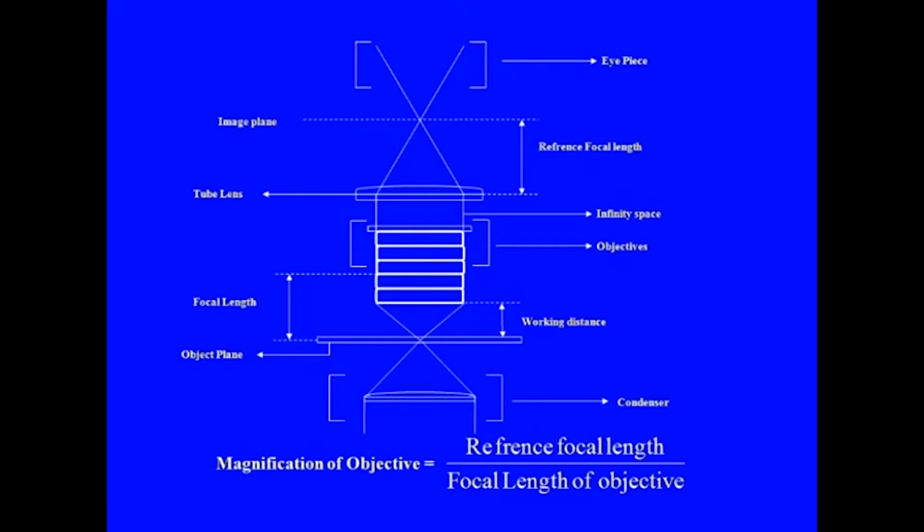And so, essentially, when you have to determine the magnification of the objective here, you have to take two things.